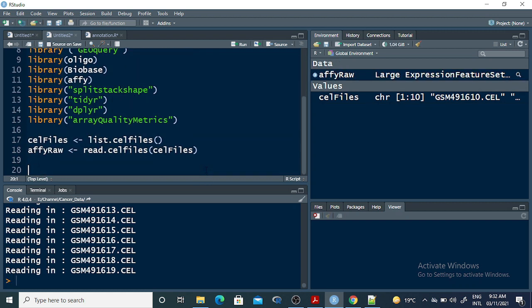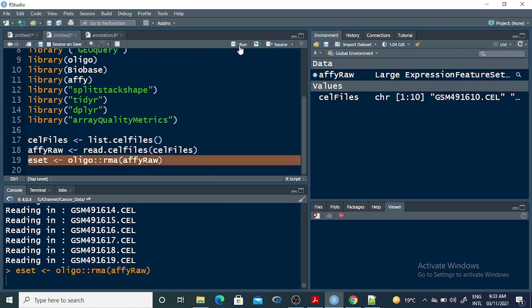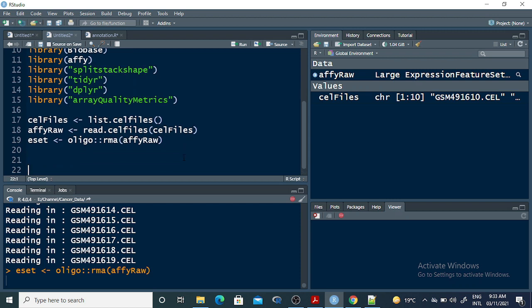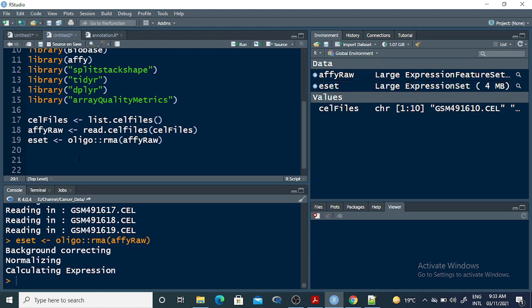Now I perform the RMA normalization: normalization_rma <- oligo::rma(fe_raw). When I run this command, it will normalize the loaded files through multiple steps — first background correcting the data, then normalizing the data, and then calculating the expression of each probe present in the CEL files.